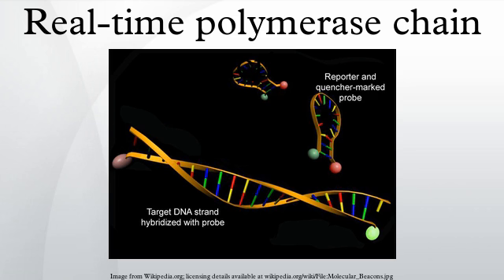Quantitative PCR can also be applied to the detection and quantification of DNA in samples to determine the presence and abundance of a particular DNA sequence in these samples. This measurement is made after each amplification cycle, and this is the reason why this method is called real-time PCR. In the case of RNA quantitation, the template is complementary DNA, which is obtained by reverse transcription of ribonucleic acid. In this instance, the technique used is quantitative RT-PCR or qRT-PCR.